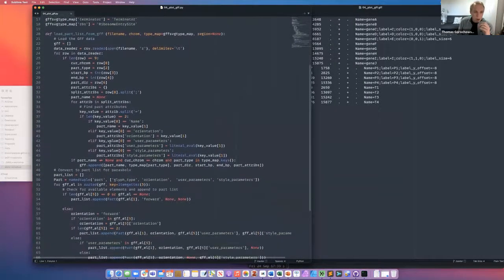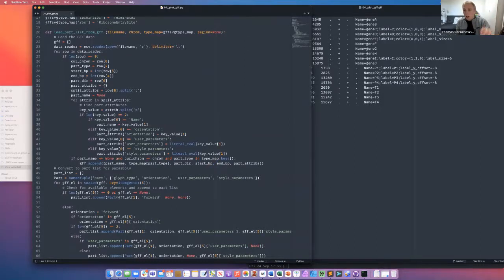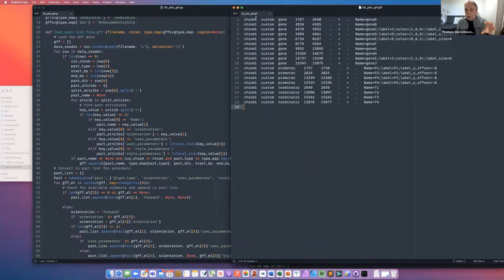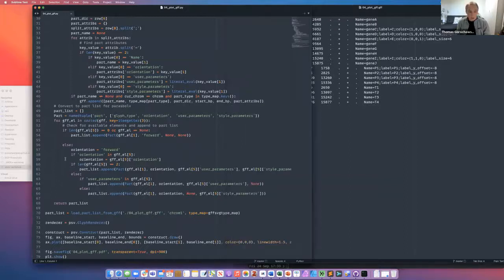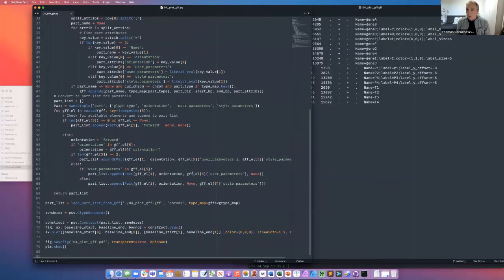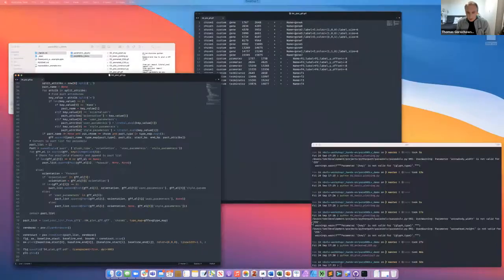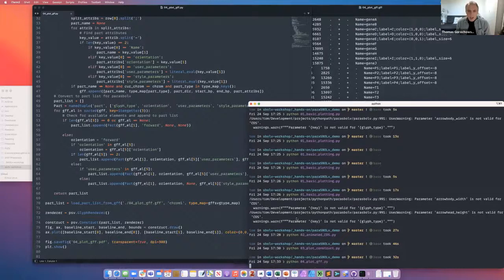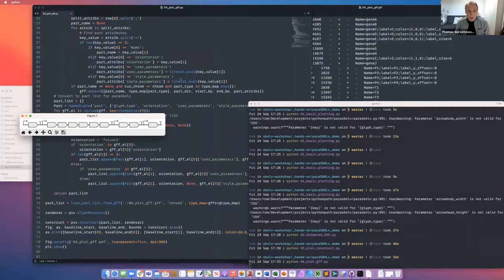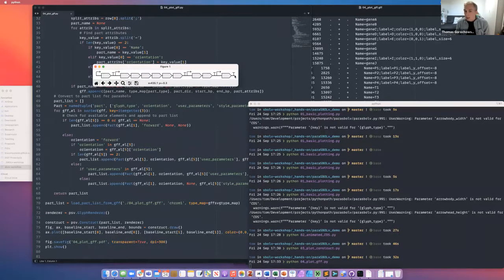I'm not going to go through this, don't worry, but basically some parsing code that can take one of these files, extract out each of these elements, and generate a construct that encodes those various elements in the right order, and then just render them immediately to the screen. That's what this example does. It takes this specific GFF file and then it's able to render this particular design.